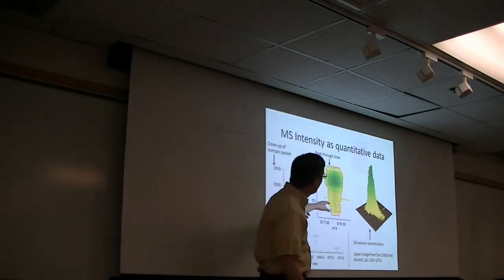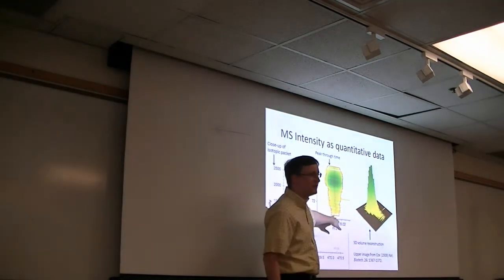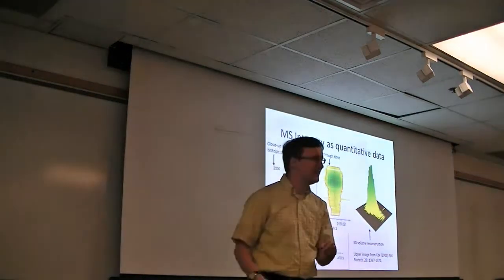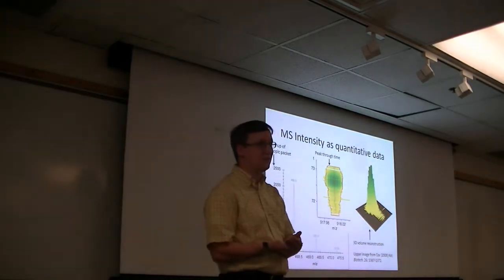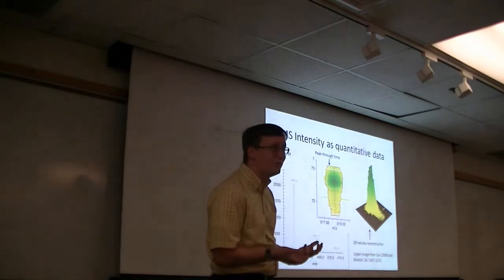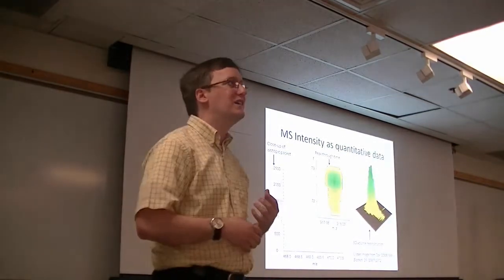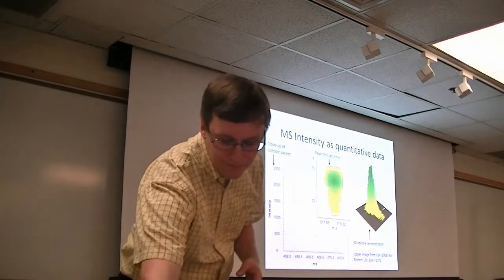I mean, we're all hoping for data that are this lovely. They've got this nice rounded peak here, a limited amount of tailing to substantiate it, and you don't see a whole bunch of jaggedness and bouncing up and down in the intensity signal. Of course, as you get to lower and lower intensities, though, the degree of variation that we see in intensity is going to grow. So, being able to deal with these as quantitative data requires that we have some sensitivity to that amount of variation.